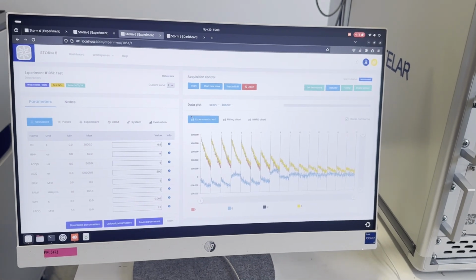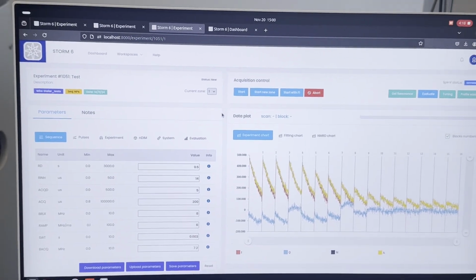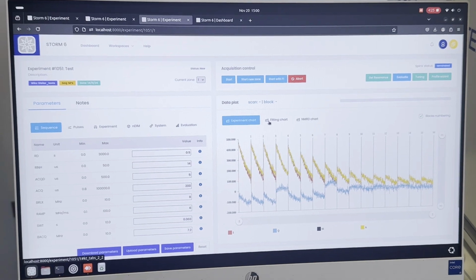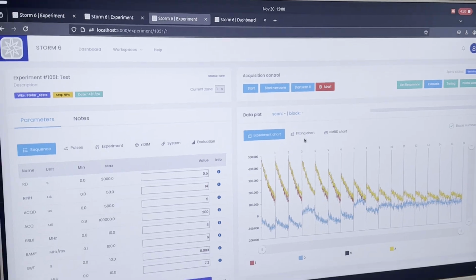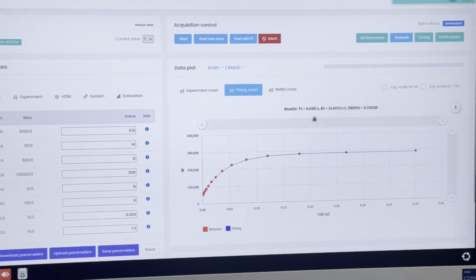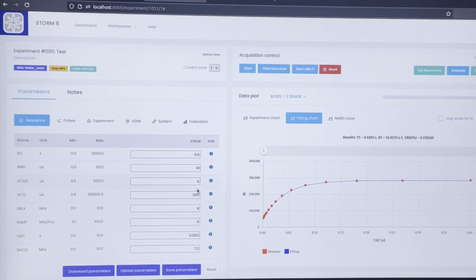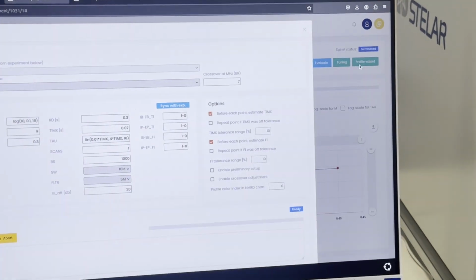the next thing to do is to open a simple NPS experiment or PPS experiment if you want to measure the T1 value of your sample, or you need to perform an NMRD profile. As you can see here, we have performed NPS on our instrument, and if we press evaluate, we will know the T1 value of our sample at 8 megahertz of relaxation field with these parameters which are related to our sample.